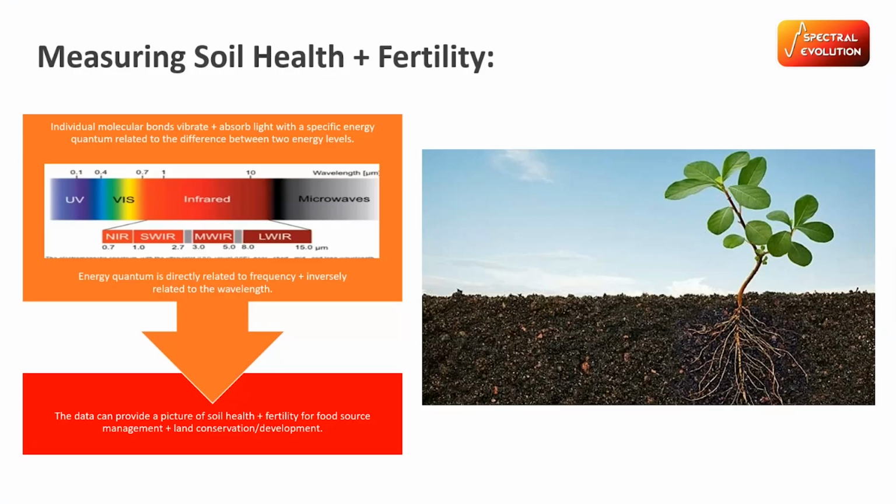We've had a webinar on identifying different clay minerals in soil, and I would recommend going to look at that for how these absorption features can be indicative of different fine mineral analysis. By analyzing these kinds of absorption features, we can reveal a detailed picture of soil health, fertility, and help inform better food production and land conservation and sustainable development practices.